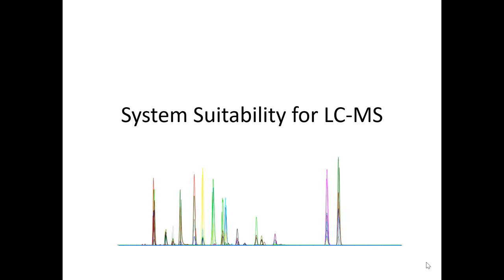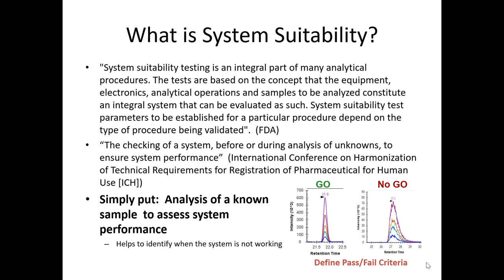done properly. Now, the mass spec itself is a system, but what many people are using here is more integrated with the chromatography and the mass spectrometry. So normally we can tune and calibrate the mass spec, you can tune and calibrate the flow meters or the flow rates or the pressures or do leak tests on the LC, but when you put them together, there's that little weak point of what may or may not be happening there. So system suitability is designed to test the entire system, the LC and the MS and their integration point.